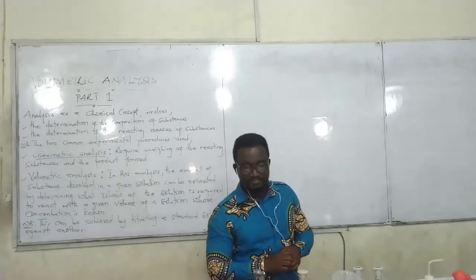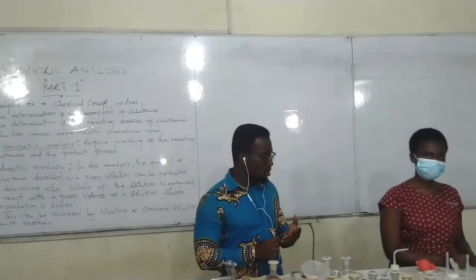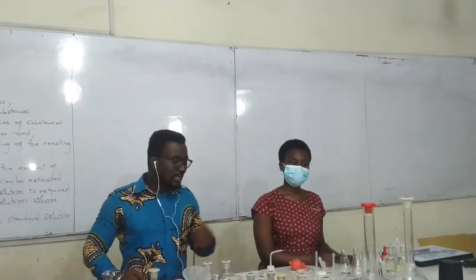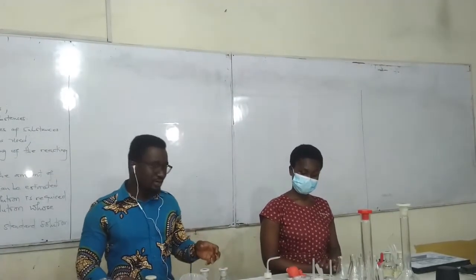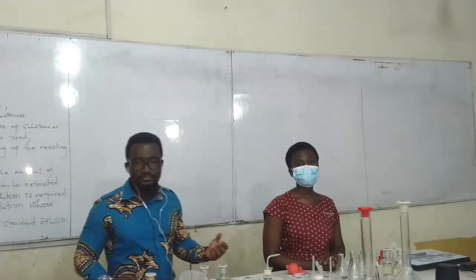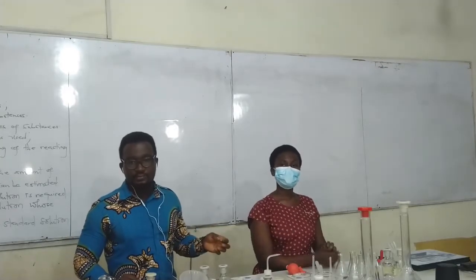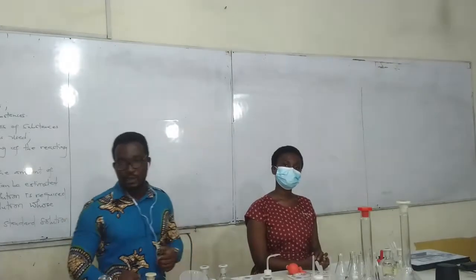Therefore, we return to our madam, who will help us understand the nature of certain substances in the presence of certain indicators. Let me introduce you to a few apparatus and materials that will be necessary for us to perform this practical. But I first want to introduce our madam, Madam Abena Prempeh Jennifer. She is going to help us with the practical we are going to perform today.